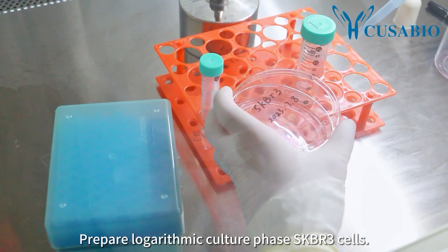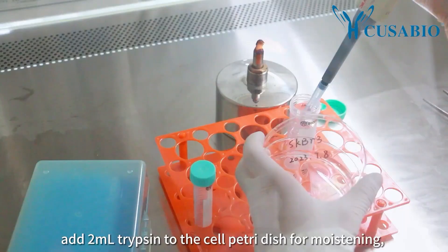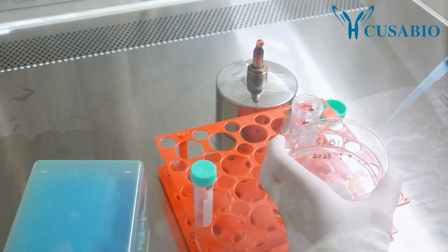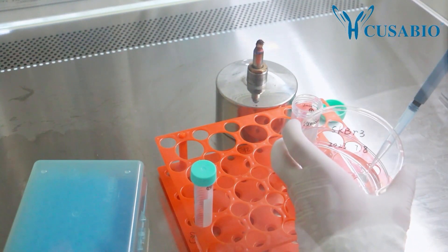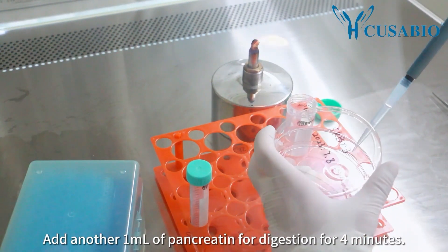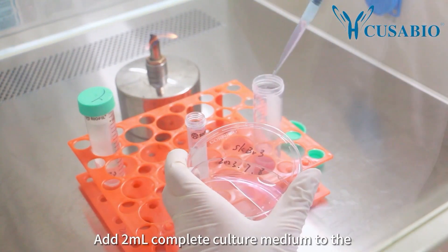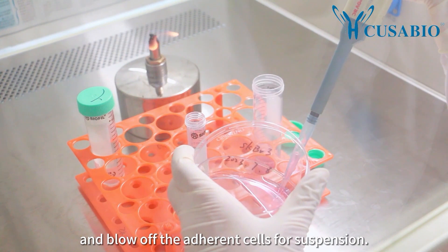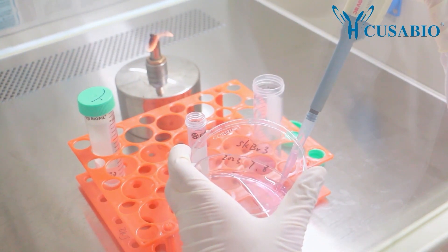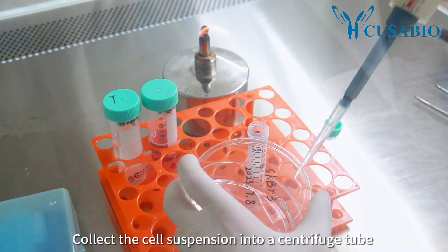Prepare logarithmic culture phase SKBR3 cells. Remove the culture medium and add 2 milliliters of trypsin into the cell petri dish for moistening, then remove the trypsin. Add another 1 milliliter of pancreatin for digestion for 4 minutes. Add 2 milliliters of complete culture medium to the petri dish to terminate digestion and blow off the adherent cells for suspension. Collect the cell suspension into a centrifuge tube.